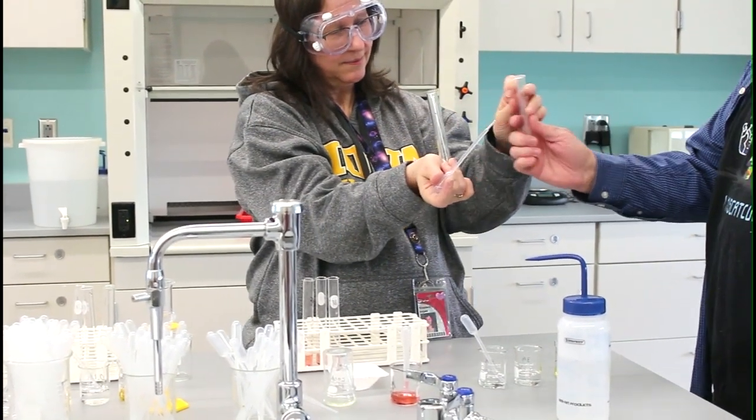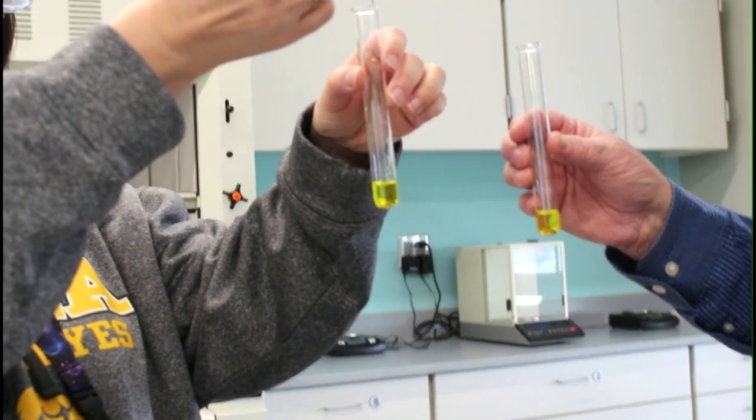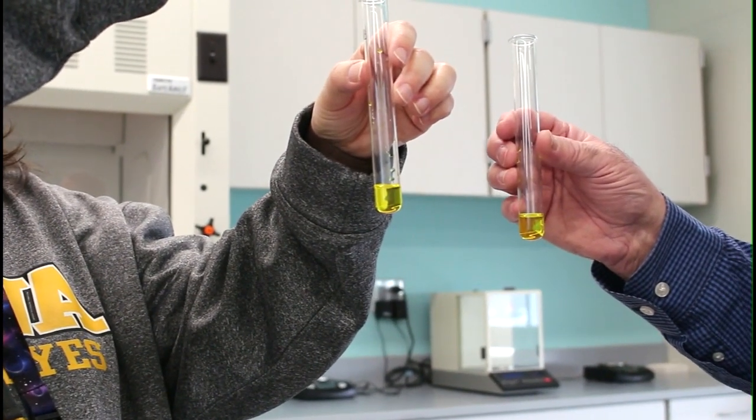Is the background okay? Can you see the color? This is what you guys are going to have to write about. By the way, in the background, it says that dichromate is a different color than chromate. Right. Okay, so this is the chromate species. I'm going to stress the equilibrium.